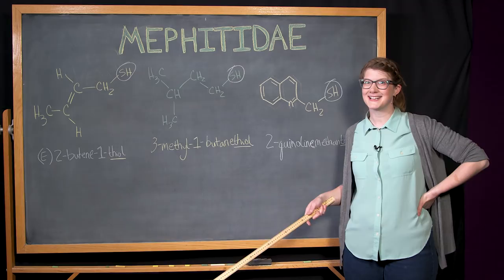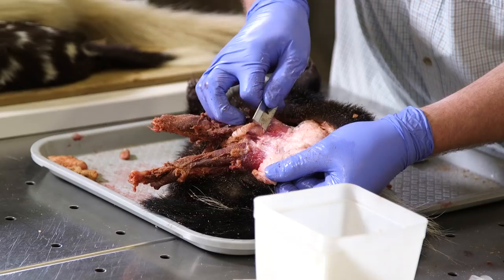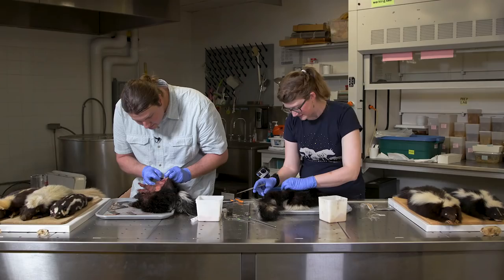You can see here the striated muscle that runs across the anal gland. She can basically clench her glutes — almost like clenching your butt — and spray. This smells so bad.